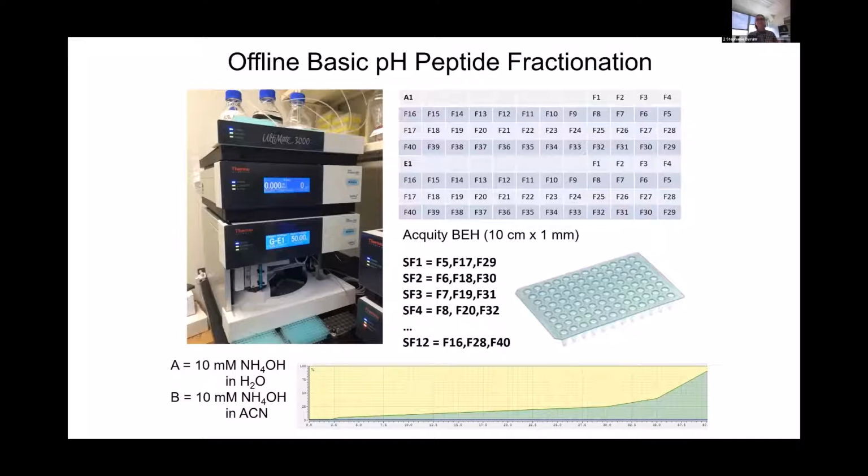I forget exactly. So for serum, we're getting rid of all the high abundant IgGs and albumin. So you do a different sample prep, and then we've found good success with sequencing those. Your proteome is a lot less in a serum sample than in a tissue sample where you're trying to get more. So we have had better success with DIA on those. We had great success on serum samples with DIA as well. It worked really well. Yeah, good to know.